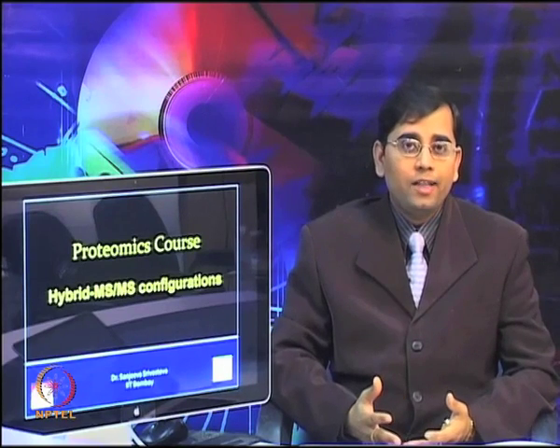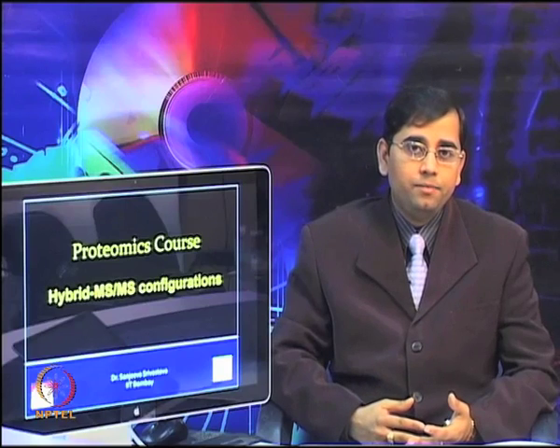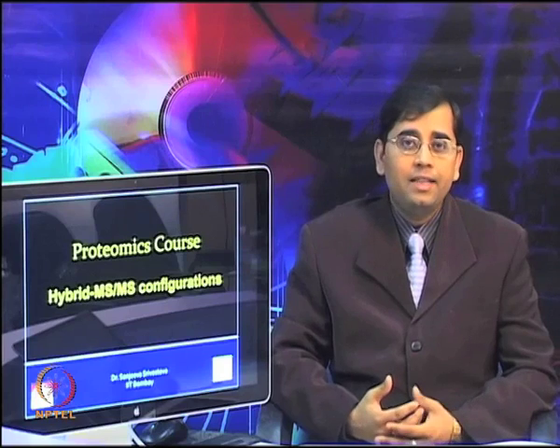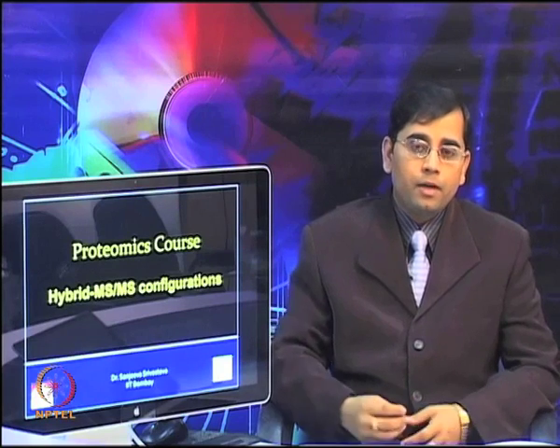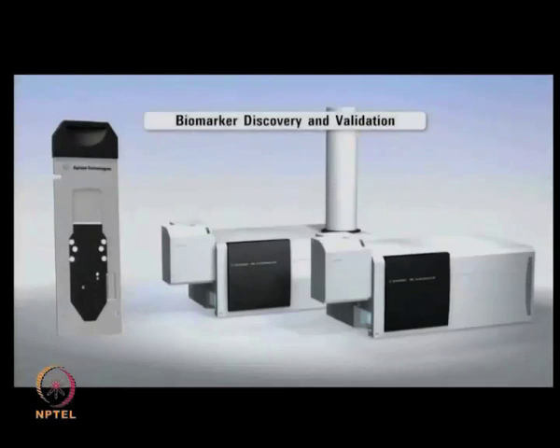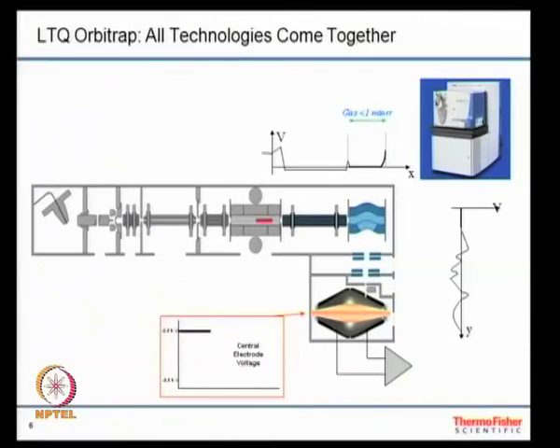There are several new advancements which have happened in this field, and to keep up the pace with these recent advancements, in today's lecture, I thought to involve a discussion on hybrid MS-MS configurations and talk with two leading companies, one with Agilent Technologies for Q-TOF and triple quadrupole, as well as the chip technology, and then with Thermo Fisher about the Orbitrap technology.